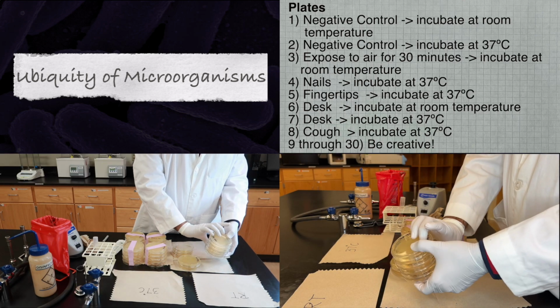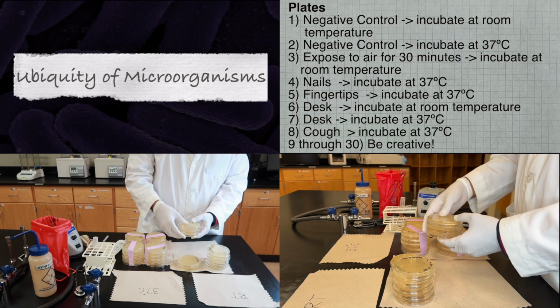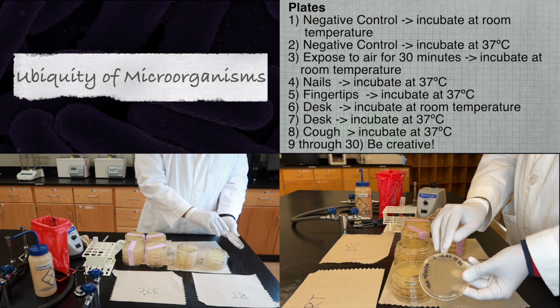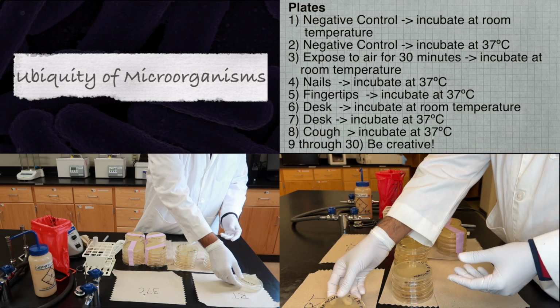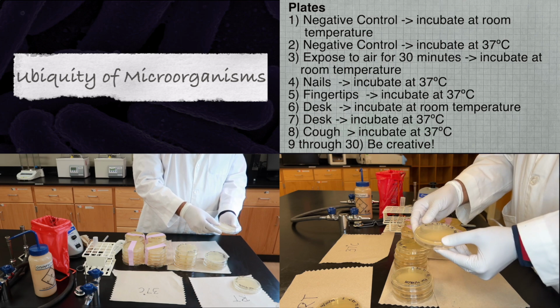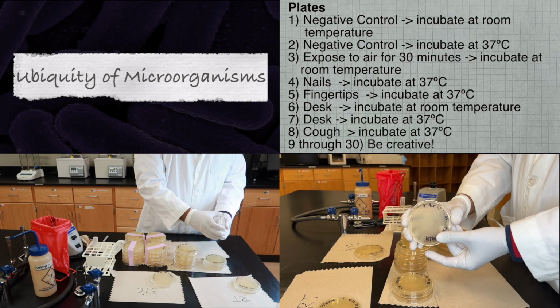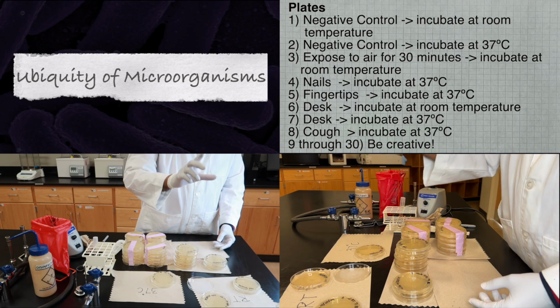Plate number 1 is a negative control. This plate we will not intentionally expose to any microorganisms and hypothetically should remain sterile. This plate we will incubate at room temperature. Plate number 2 is also a negative control, but we're going to incubate it at 37 degrees Celsius. Plate number 3 we will open and expose to the air for 30 minutes and then incubate at room temperature.